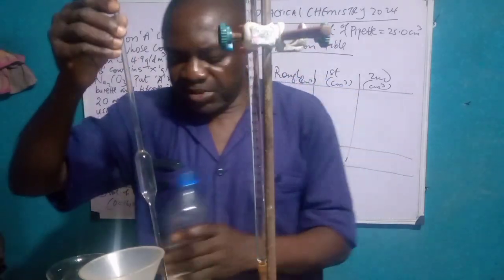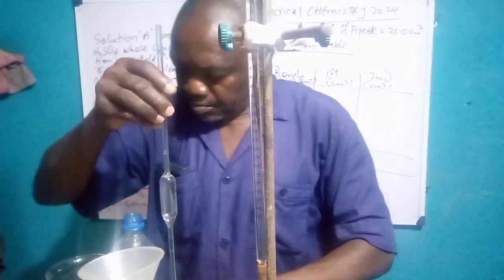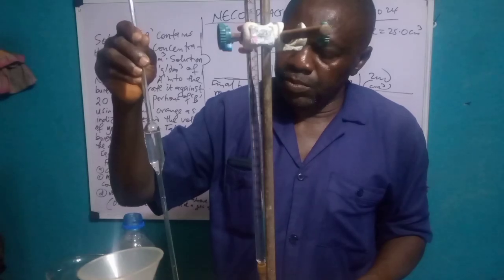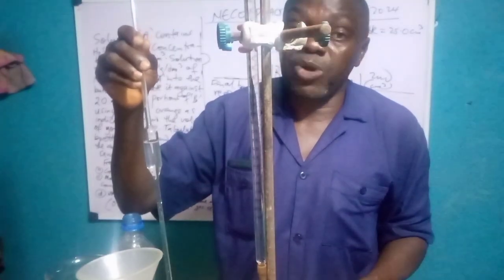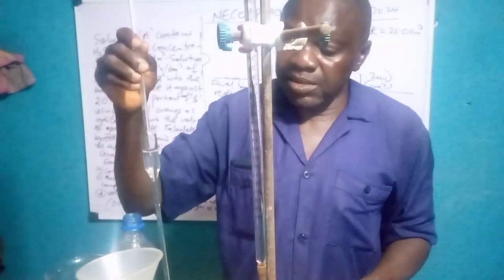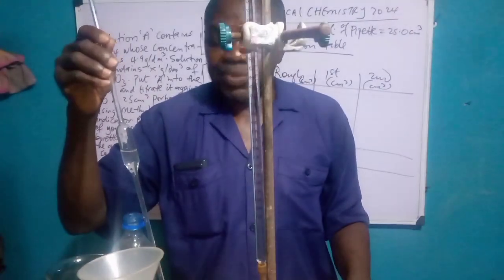Then I drop it inside. Ensure you are very steady when you are doing it. And remember, another precaution, you must not blow the last drop with your mouth, because the manufacturer has already made it in such a way that the last drop will always remain there to make it exactly 25 cm cube.